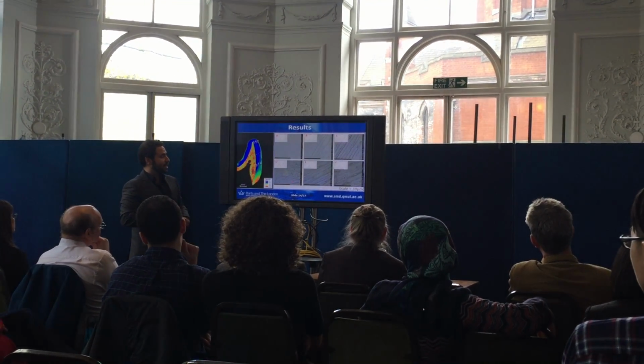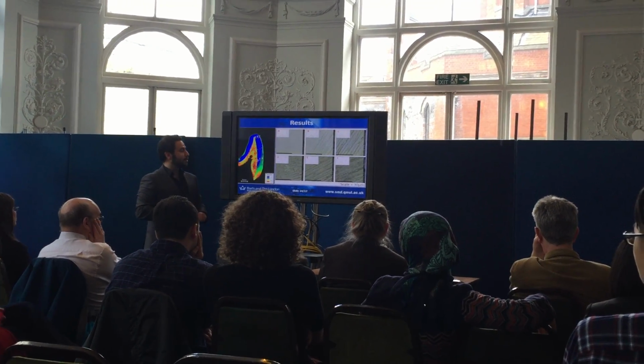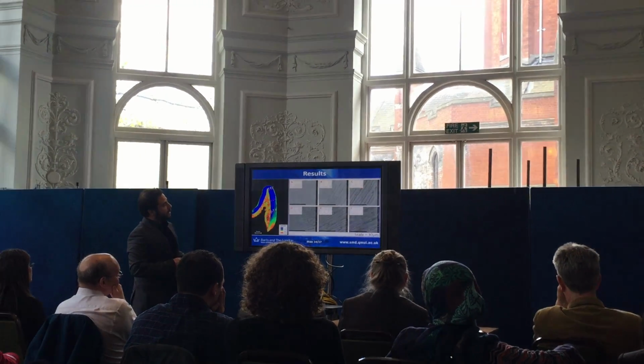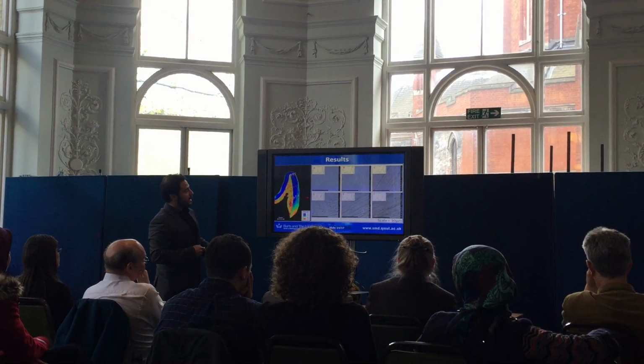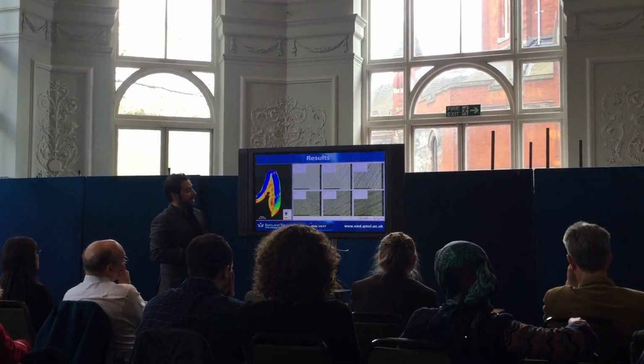As you can see, we have this, and we have this, and that kind of confirms that what we're seeing is 2 different populations of prisms. So the first 3 images here are A, B, C, which are the cusp. The bottom images are D, E, F, less developed. And concentrate on F, B, and A now.